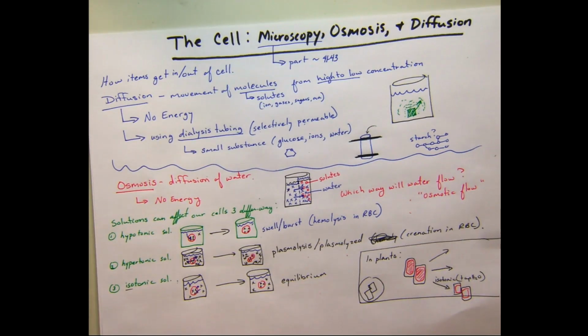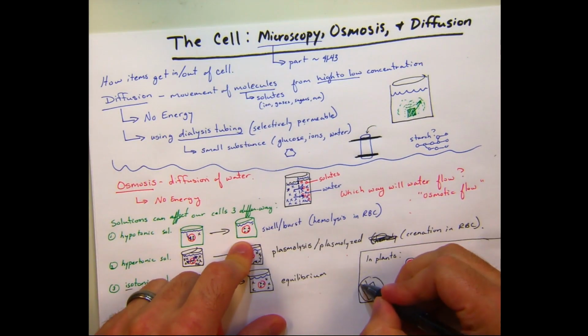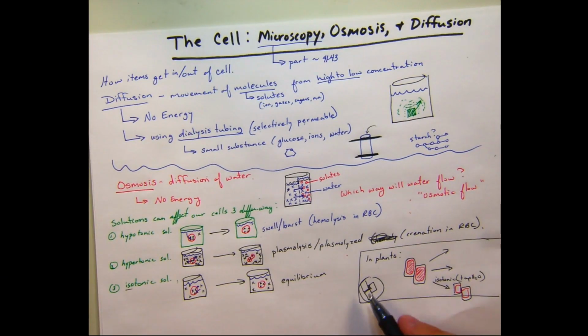Do not grab the objective to increase it. There's a little nose piece. If you grab those objectives, you can untwist them. You can pull them out. But you don't have to draw every single one. At the highest magnification, you should be able to see at least like 10 or so. And I'm just drawing 2 of them, 3 in this case.